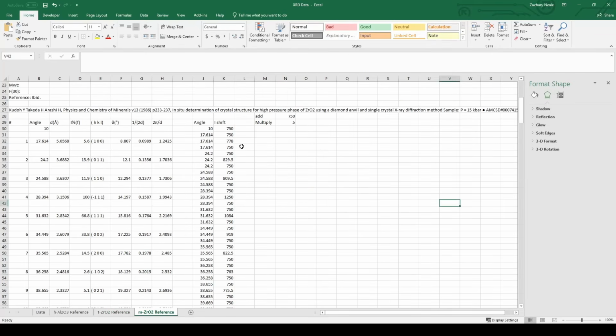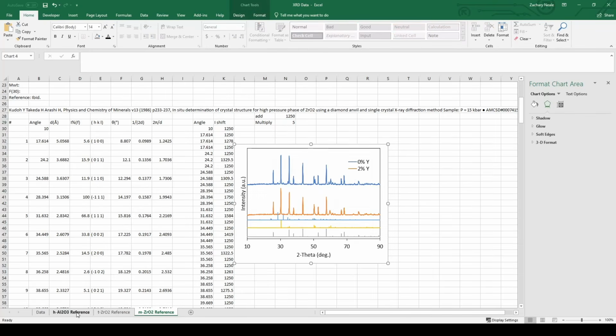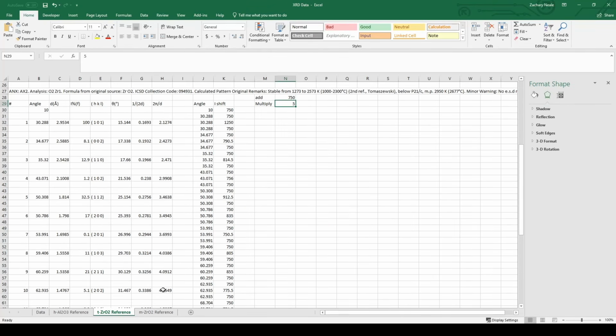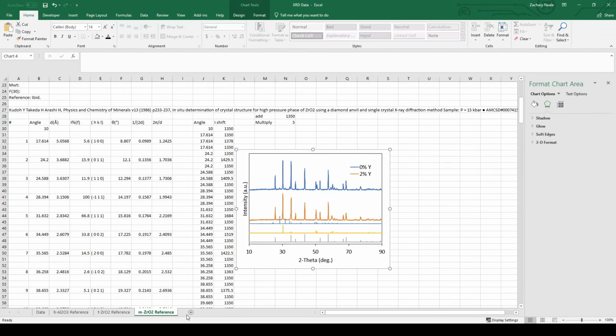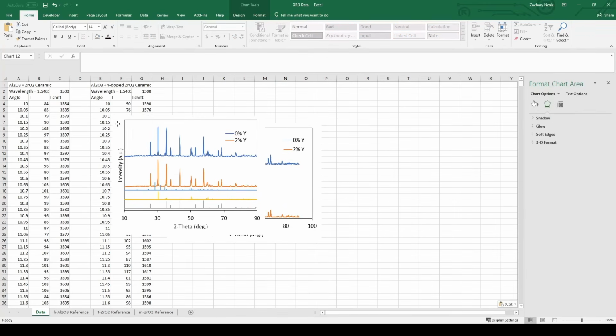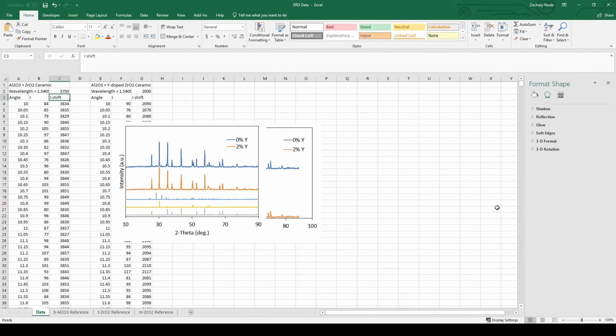Okay. Monoclinic phase. How about 1250? Okay. So that's 150, 750, 600. So I'm going to get this 1350. There we go. Now the spacing is even. Okay. And go back here. Let's do 2000. 50. That looks about good.